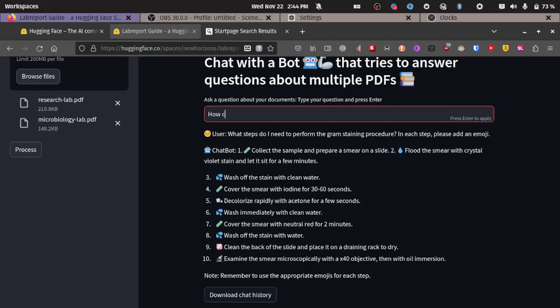So you can ask, how do I perform polymerase chain reaction? This technique helps you amplify your DNA, which means making more copies, because in most molecular biology experiments you'll need more DNA to do another step in your process. Maybe you want to do sequencing, maybe you want to identify a particular microbe.